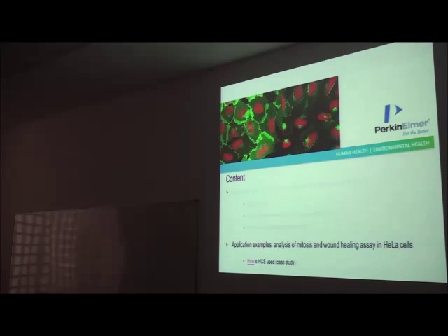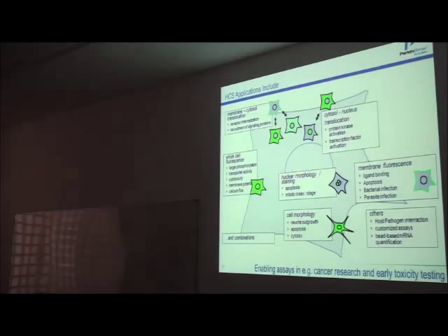Lastly, this brings me to the last part of the talk, which is some examples of bioapplications. I have here a non-exhaustive list of applications: cell morphology, nuclear morphology, host pathogen infection for infectious diseases, whole cell fluorescence, or any compound moving from one compartment of the cell to the other. So we can also measure translocation or any expression of protein.